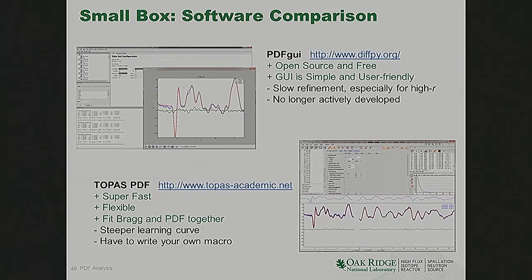And a little bit more about the pros and cons of the different software programs available today. And I would encourage you, if you're interested in this area, they're actually pretty fun just to play around with, and you can simulate patterns. You don't have to have experimental data to try these out.